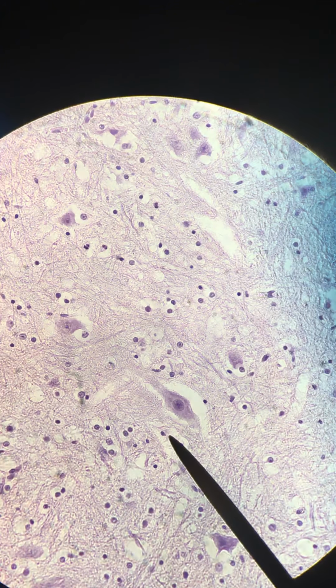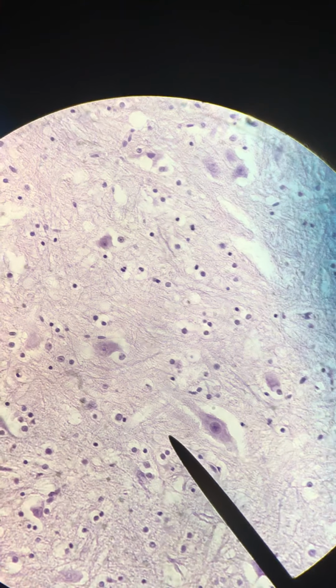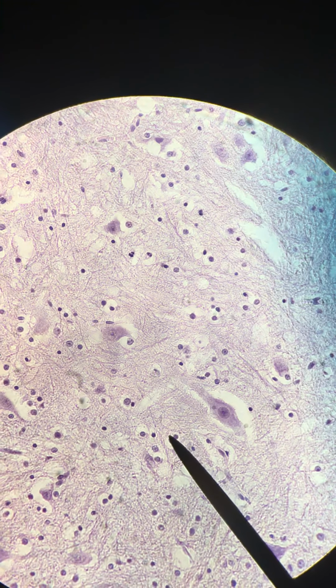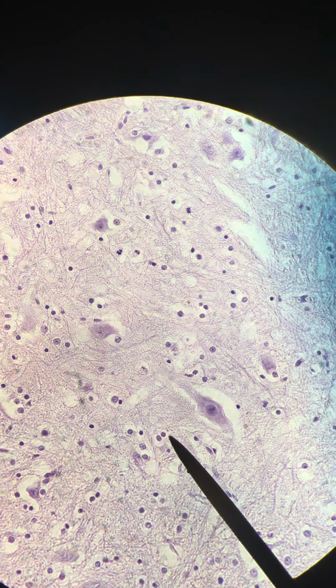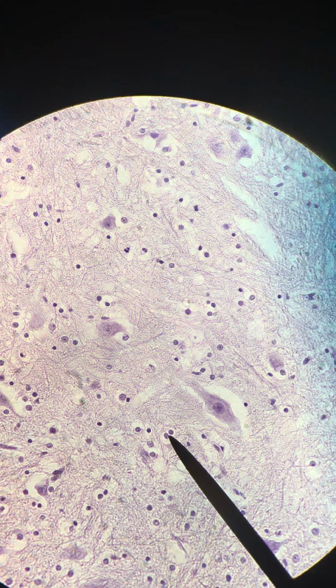Okay, and the smaller cells, which are surrounding the neurons, the large ones are the neurons, these smaller ones are neuroglia. Okay, it's like the one the pointer's on now, as well as the one next to it. Those would both be neuroglia.